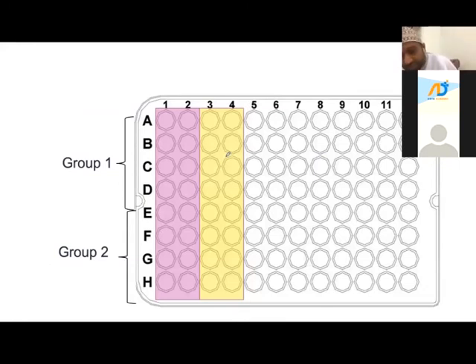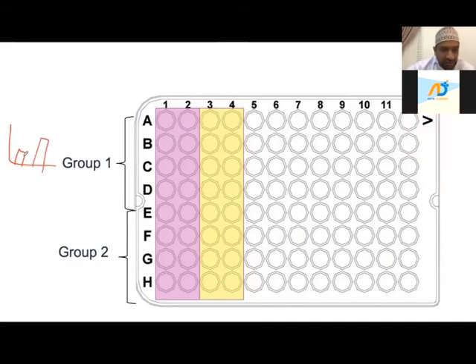And this is actually, I need all of you to focus on this, especially those who are expert in this field. I need you to focus on this because there are different ways to analyze the real-time PCR data for gene expression and for quantification. Now, suppose that I have a study where I'm going to have 2 groups. So I have a group number 1, like untreated and treated group. I want to get a bar diagram with the standard error, and this is my sample size. So this is group number 1, which is the control group, and group number 2, which is the treated group.